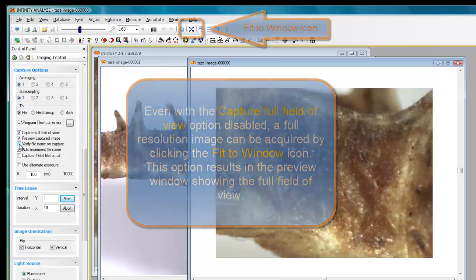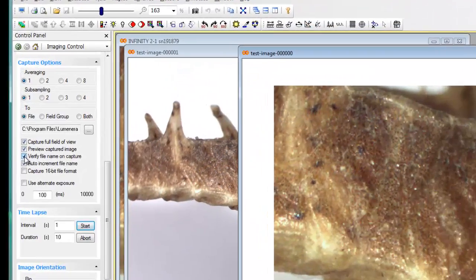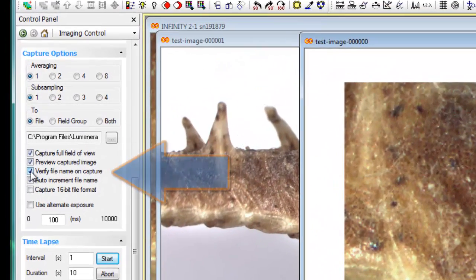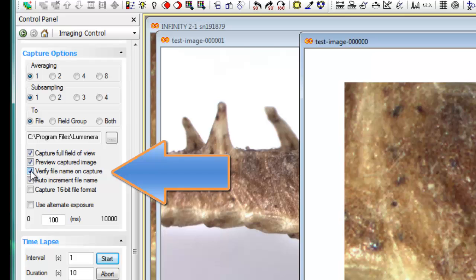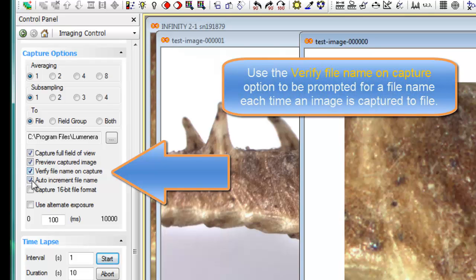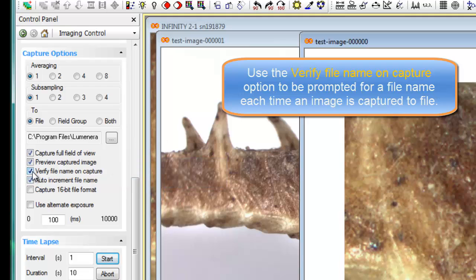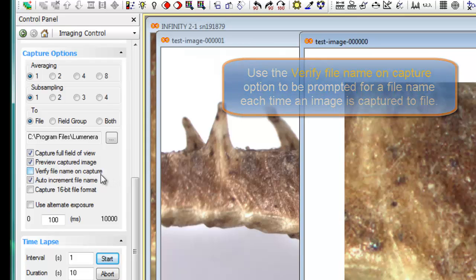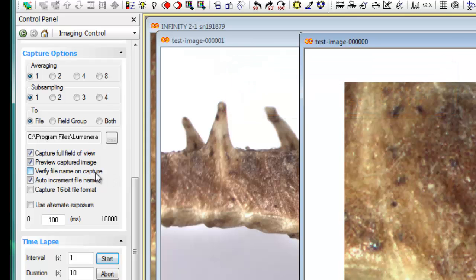Verify file name on capture when enabled will just prevent you from overwriting a previously captured file. So if you're not using the auto increment file name or if you want to make sure that you're setting the correct root file name or prefix, you can specify to verify file name on capture each time.